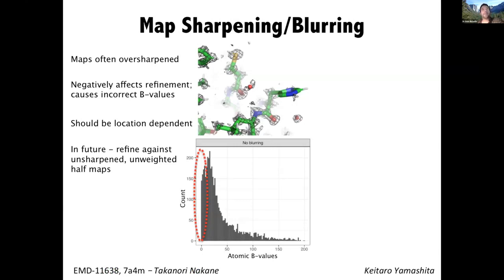Map sharpening and blurring is very important to consider when refining against cryo-EM maps. Maps are often over-sharpened — you can see in this case that the map is clearly quite noisy. If your map is over-sharpened, this can negatively affect refinement and causes incorrect B-values. In the histogram you can see a large number of atoms with extremely low B-values close to zero, which doesn't make any sense. Atomic B-factors should not be close to zero; they should have a nice shifted inverse gamma distribution. If the map is too sharp, the whole distribution shifts left, and there is no way to recover from this.